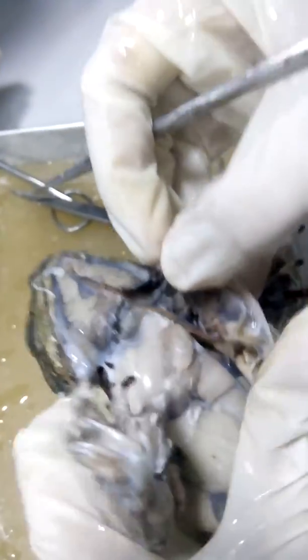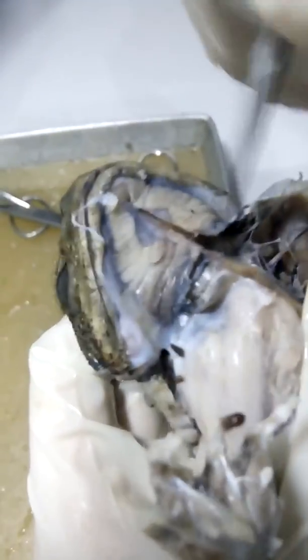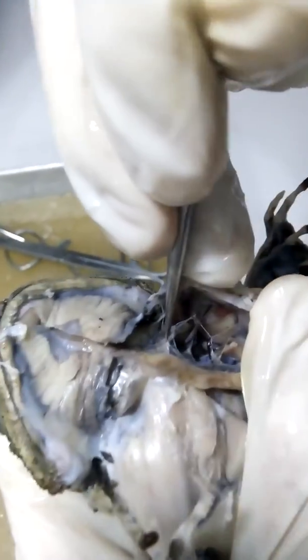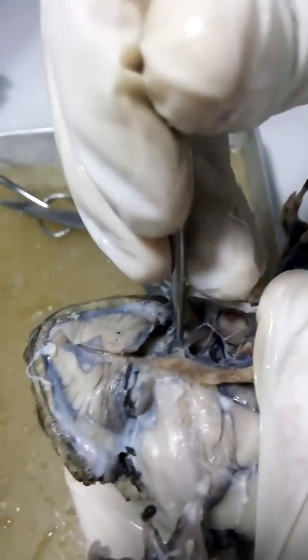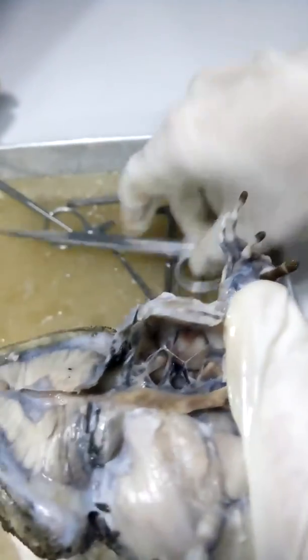So your omohyoid is lateral, very thin, very dangerous. If grabe ninyo siya iana, maputol siya. So this would be your omohyoid. And then if we cut through your omohyoid, we can see your petrohyoids.